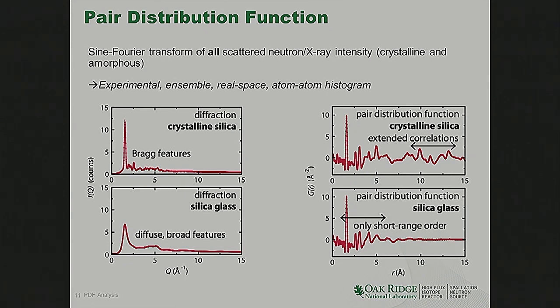If we look in real space, you'll see that their local neighboring environments are very similar. They have a difference in their correlation length scale. So this PDF goes to 0, meaning we don't find distinct pair-pair correlations beyond about 10 angstroms in that material, where here they'll keep going and going and going depending on the resolution of my instrument.